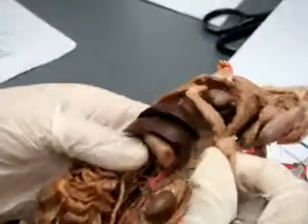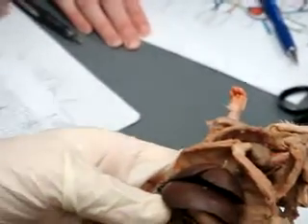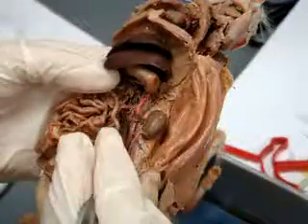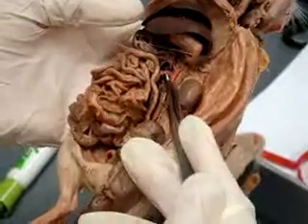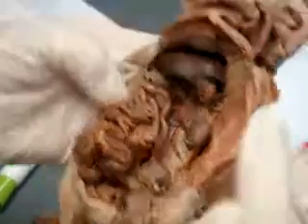Go over to the other side. Notice that your other kidney is a little lower. So it's right there. It branches off a little lower. In between those, you have this artery right here that's going to your intestines. That is your cranial mesenteric artery.